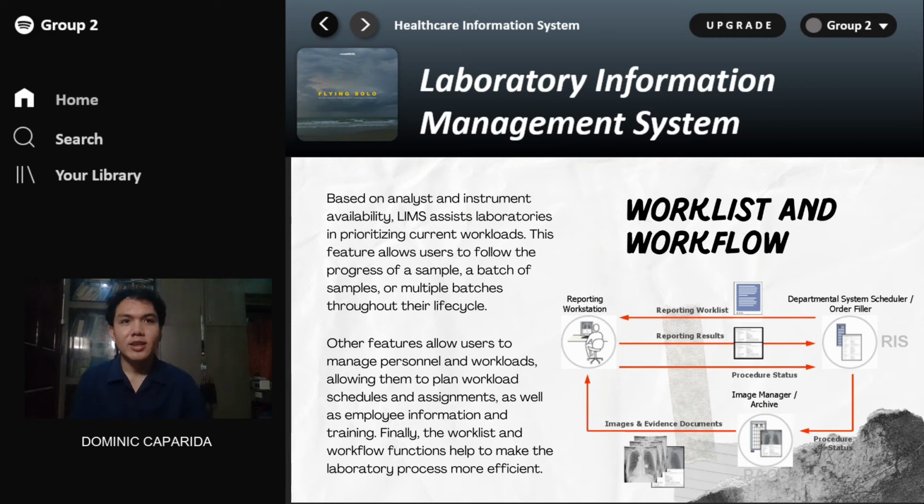Then again, this reporting station will report the results to the department system scheduler. So in that, it will come to decision making and work for a diagnosis.